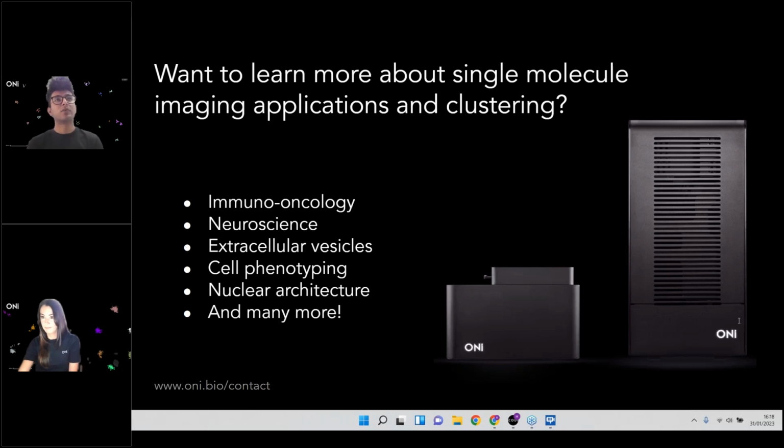Right, so that's a good question. When you're choosing any clustering method, and I'm sure many people in the audience have used things that are not even in the options that I talked about today, you should have a working level of understanding of the method and also of your biological context. As I said earlier, depending on the context, you may know more or less information about your clusters. If you don't really know what kind of clustering the biology would imply, then you should enter with an open mind and try a bunch of things first. We'd be very happy to also talk to you about that process and figuring out which method is appropriate. But in broad strokes, HDBSCAN should be able to pick out different populations of clusters, and DBSCAN should be able to pick out more uniform populations of clusters where you're expecting clusters to have similar properties. Hopefully that answers that question.